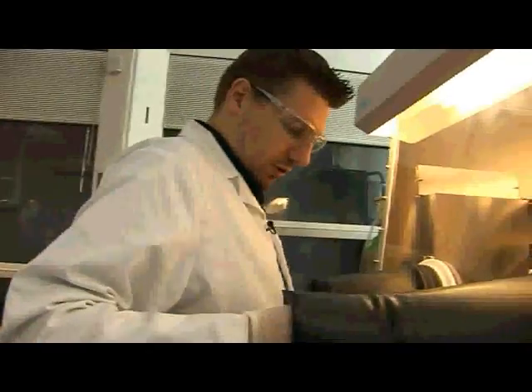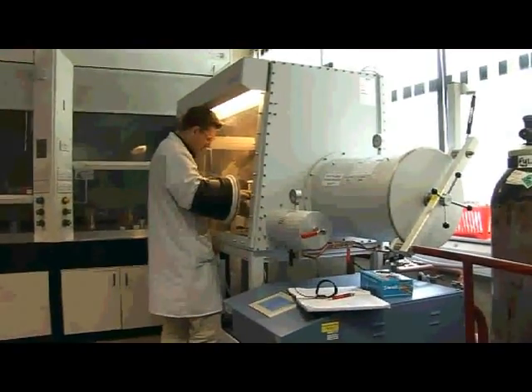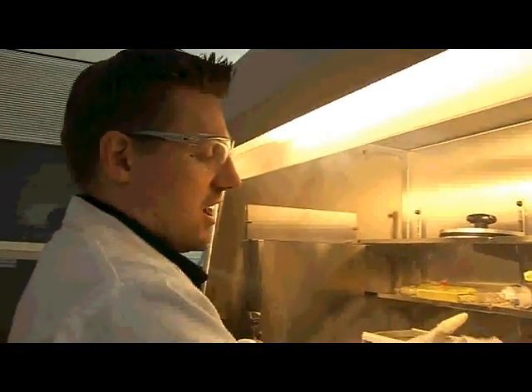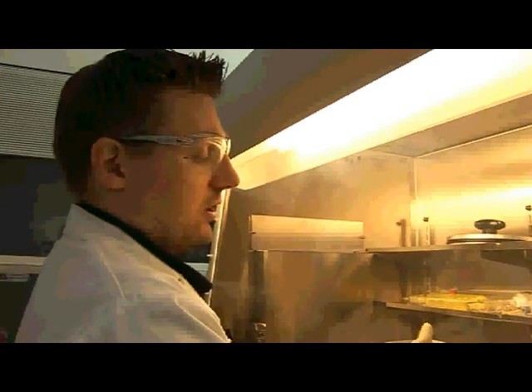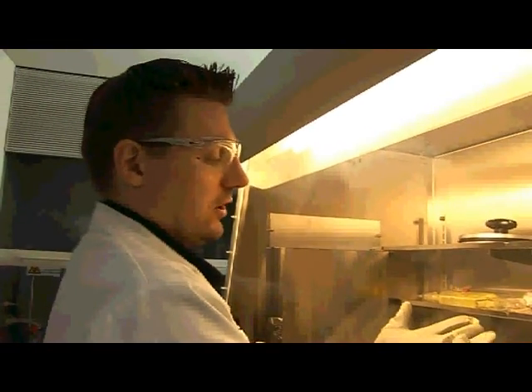So this is one of our glove boxes. If you just look to the right of the glove box, you'll see that we've got these air locks. Basically what you do is you put whatever it is you want to take into the box in there, and then you evacuate it, and then you refill it with dry, oxygen-free nitrogen. So then you can take compounds which react with air and moisture into the box safely and store them.